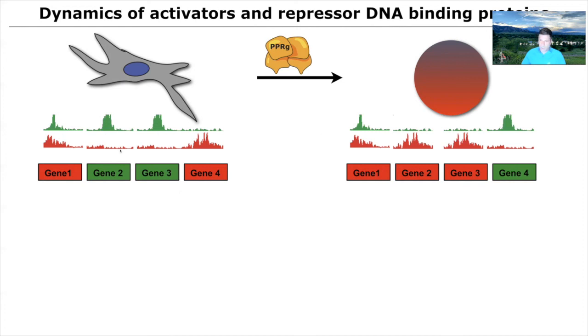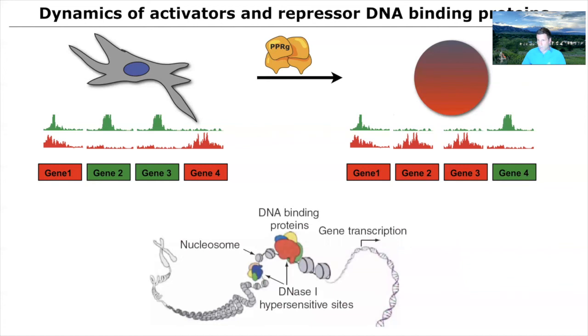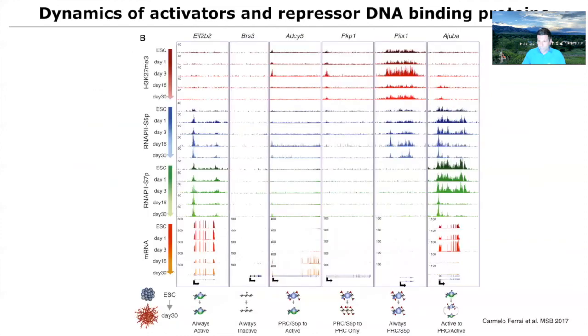And you'll see so many of these tracks, it's going to start to make more sense. But really what we're looking at is how DNA binding proteins are organized around the genome. In this picture, we're looking at 4. Imagine looking at over 100, and that's our goal for this class. Right now we've only looked at 1, but it'll still be informative, and we'll see these patterns already starting to emerge around the genome. And eventually, something like this will make sense to you of how DNA binding tracks change. Here you can kind of see a narrow peak versus a broad peak, and RNA-seq underneath these peaks.